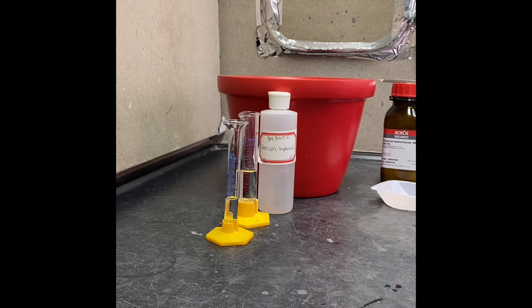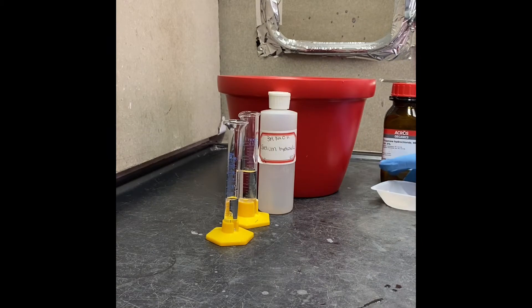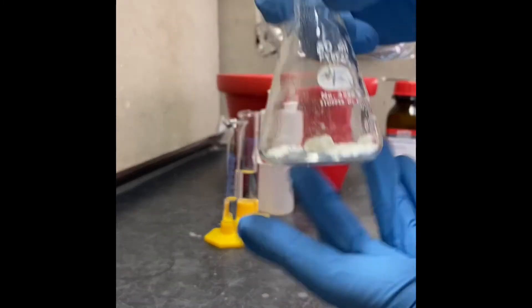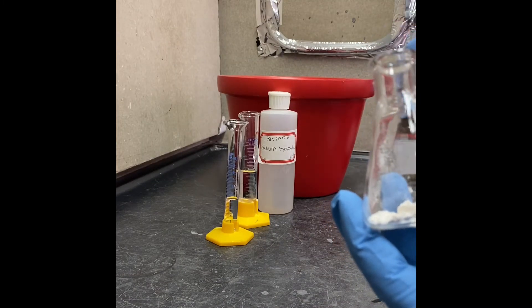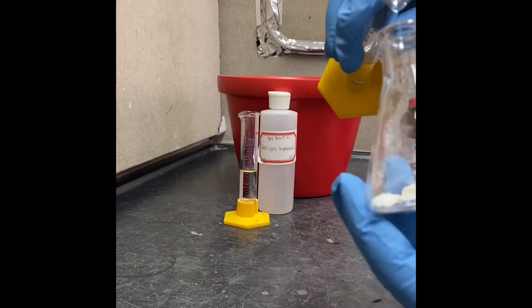I'm going to use this 50 milliliter flask and I'm going to transfer the solid to here. Transfer the thiamine hydrochloride solid here, and we're going to dissolve that in 4 milliliters of water.